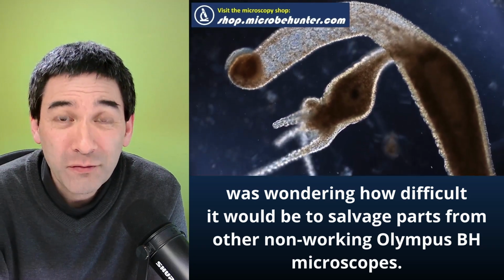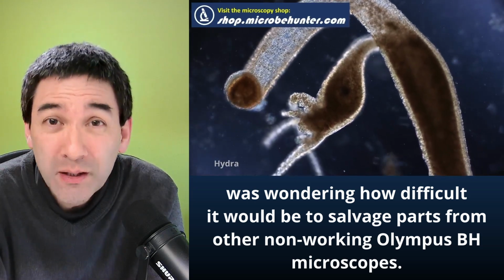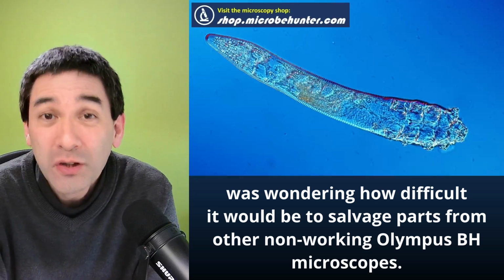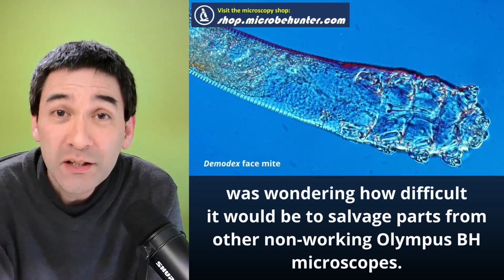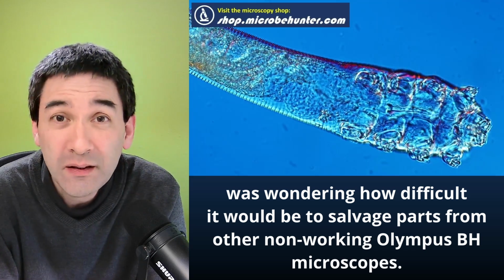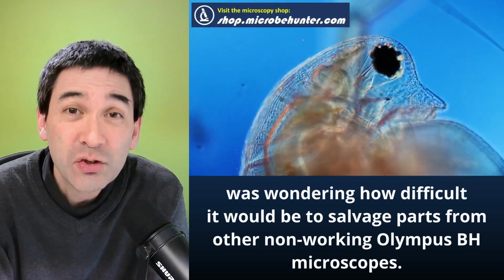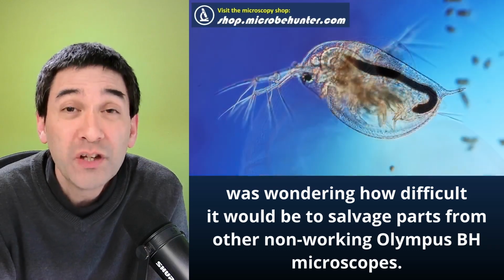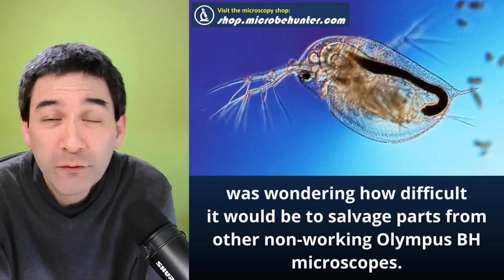And indeed, there are several people who like repairing old microscopes, refurbishing them, and then reselling them for a higher price, because then it works. The good thing about those brand microscopes is that they were actually designed to be serviceable. This means there are service manuals that you can download, and every couple of years the microscope should be disassembled to clean the gearing system and remove the lubrication oil, because over the years it becomes solid, increases in viscosity, and then you cannot turn the focus knobs anymore.